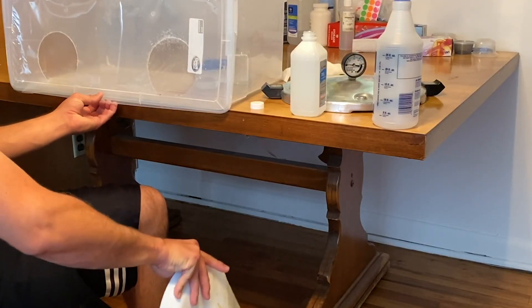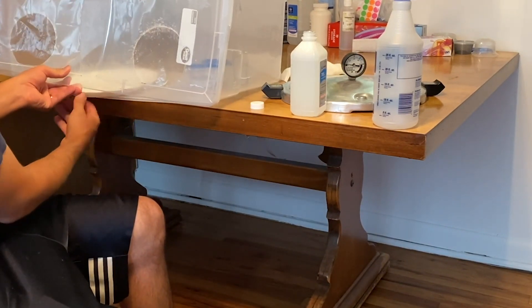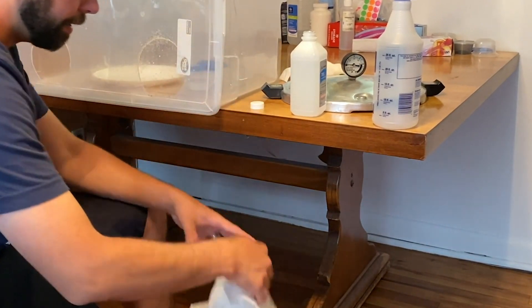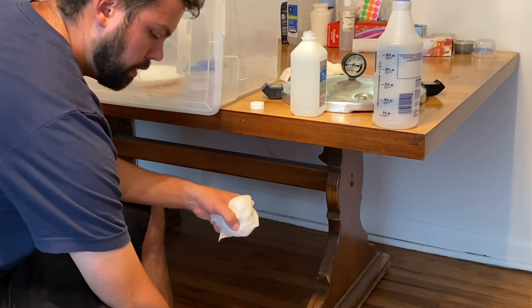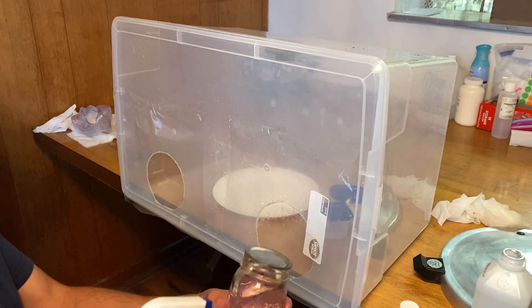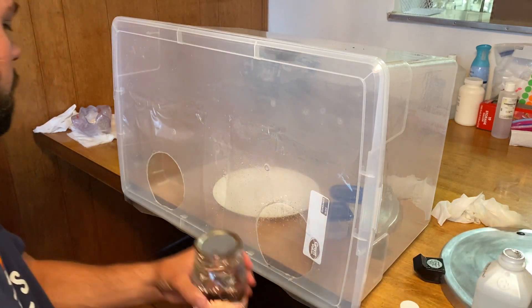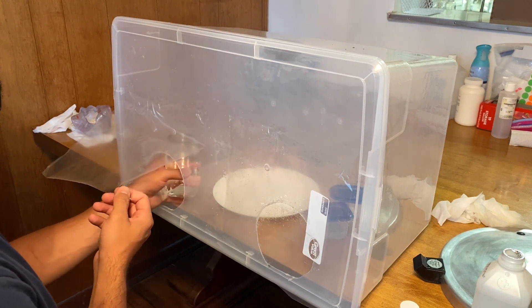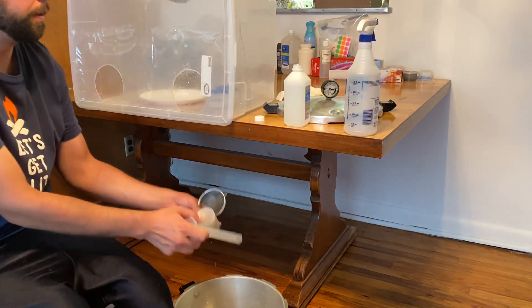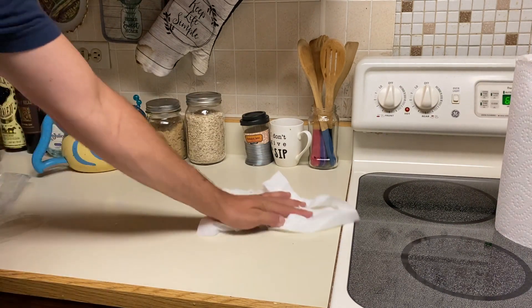For the plate, I have a paper towel on top — I just take it off quickly and move it right into the box. At this point I would also put sterilized paper towels into the still air box and spray the paper plate down and wipe it. Next I take one of the jars of water, spray it down with rubbing alcohol, and put that into the still air box.